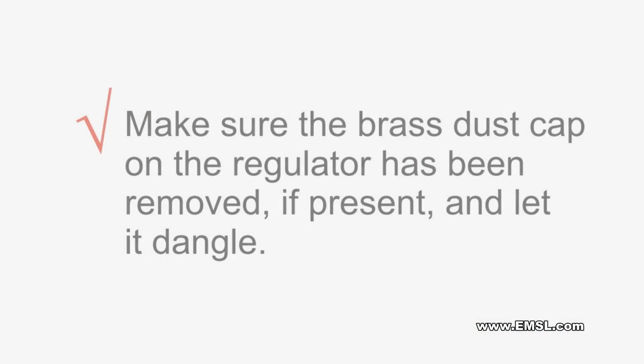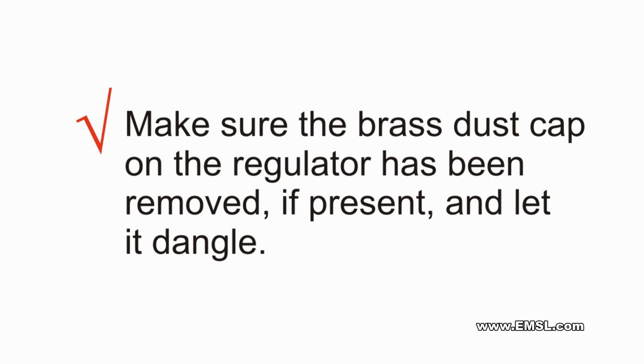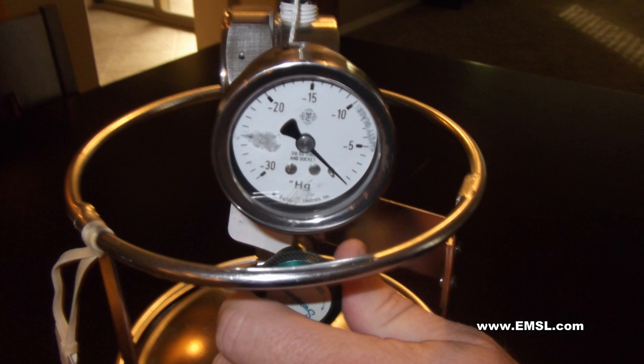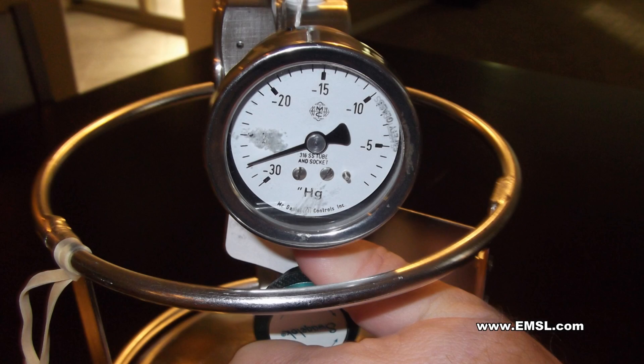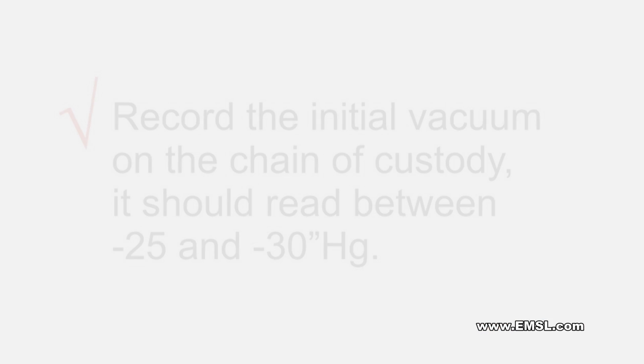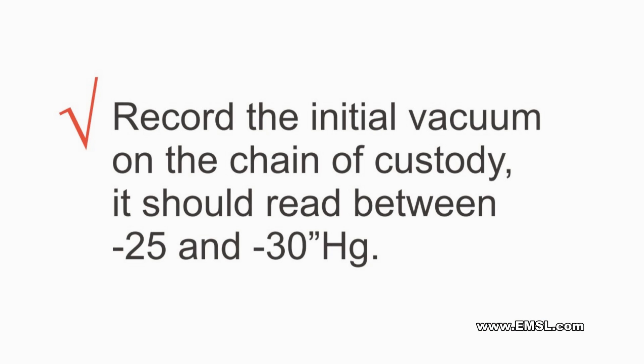Make sure the brass dust cap on the regulator has been removed, if present, and let it dangle. Open the valve by turning it counter-clockwise until completely open. Sampling will now begin. Record the initial vacuum on the chain of custody. It should read between -25 and -30 inches of mercury.